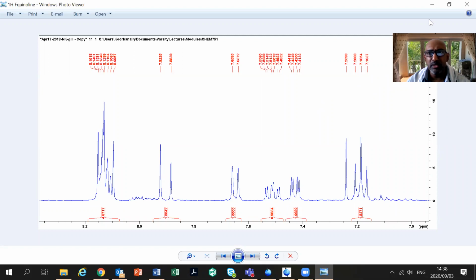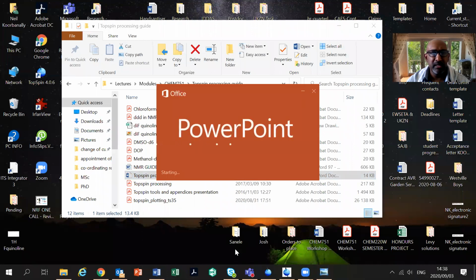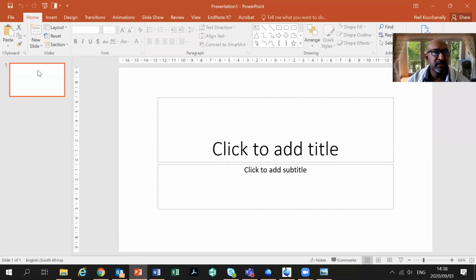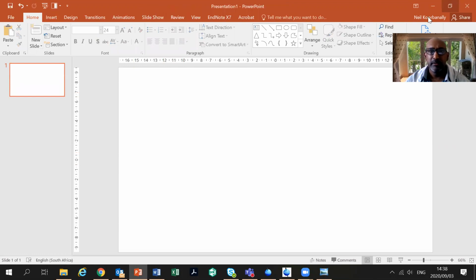It's good enough to have a presentation with this, or good enough to put in your thesis. I'll just show you very quickly, just in case I'm making a presentation to my honors class. This is what I want to do, so I can just delete that.